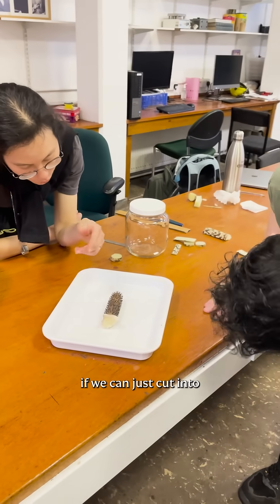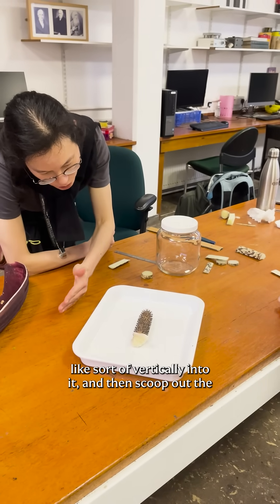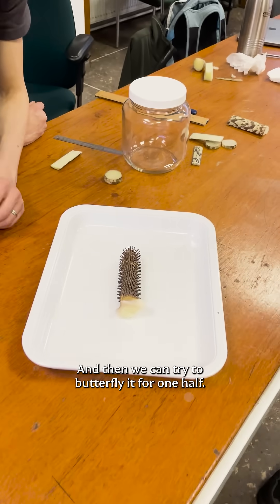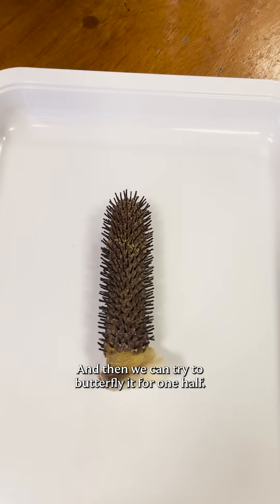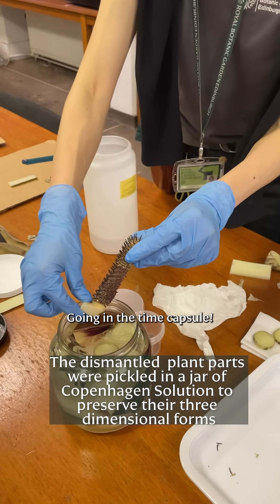So for the one half, if we can just cut vertically into it and then scoop out the spongy bits, we can try to butterfly it for one half.